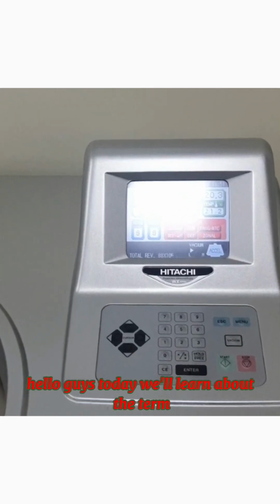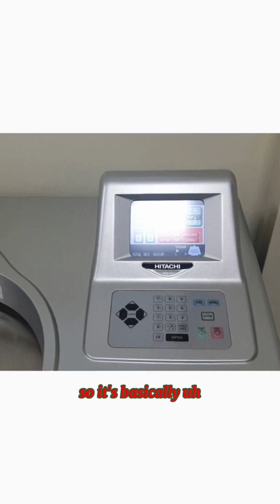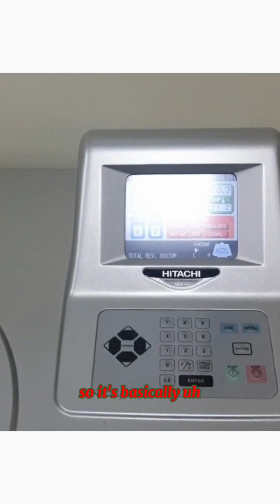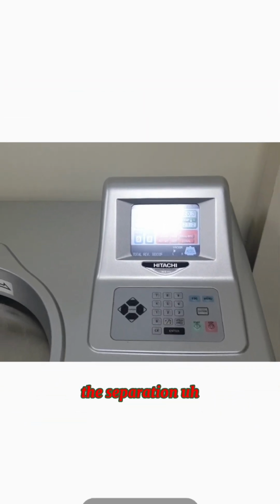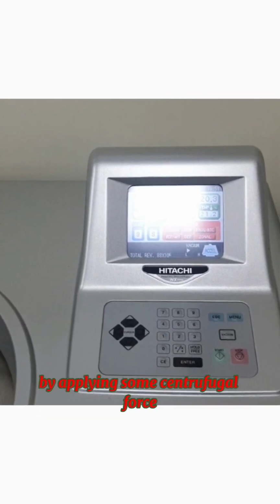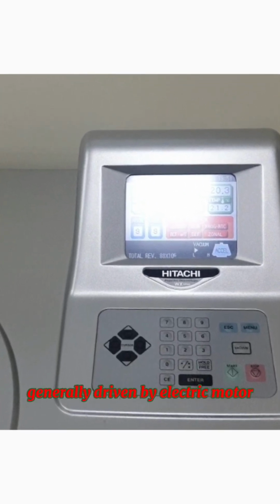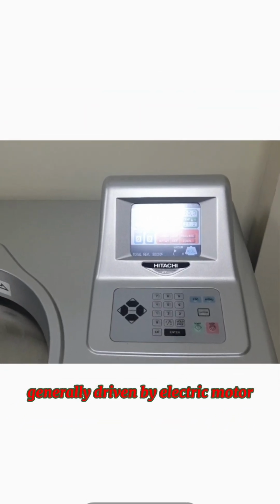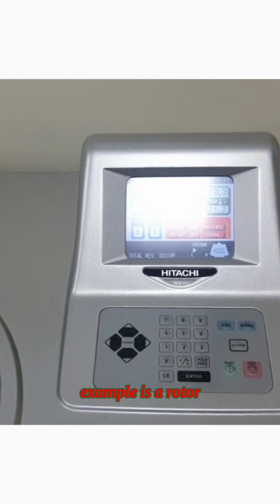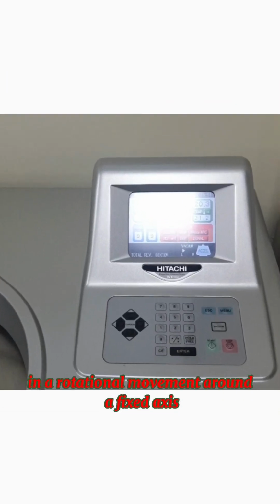Hello guys, today we'll learn about the term centrifuge. It's basically the separation of two layers by applying centrifugal force. So a centrifuge is a device generally driven by an electric motor that puts an object, for example a rotor, in a rotational movement around a fixed axis.